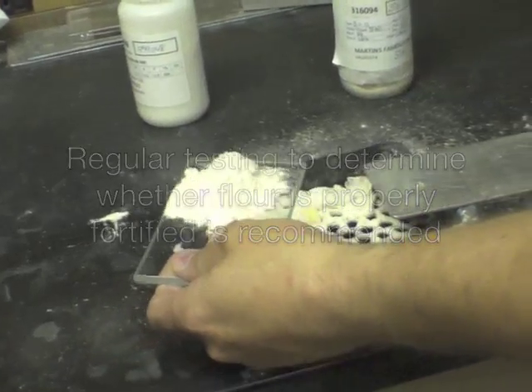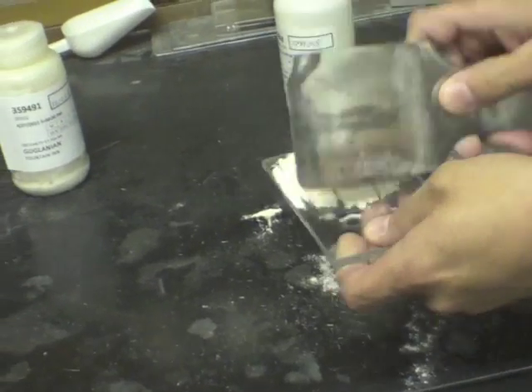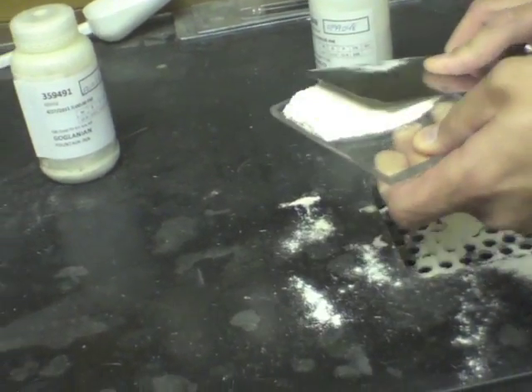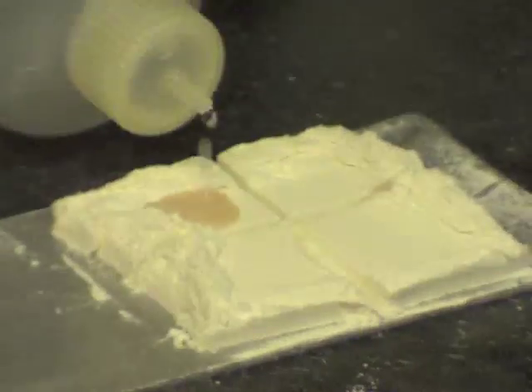There's a two-step process to it. For all of them, you have to wait approximately three to five minutes to get a good reaction. Then we have these photo cards to match up against to confirm what's actually in that product.